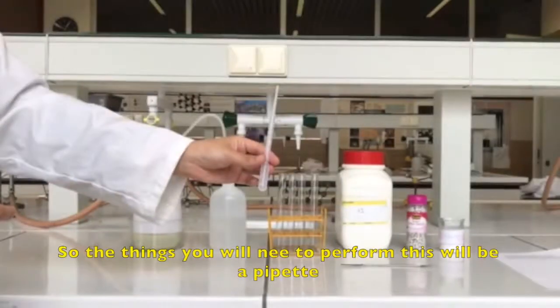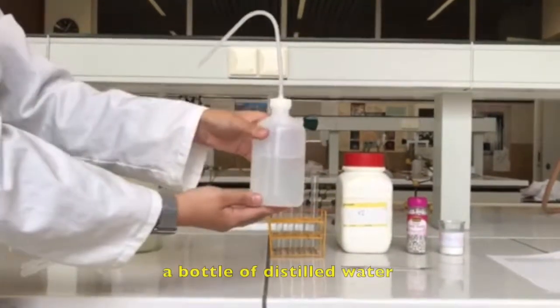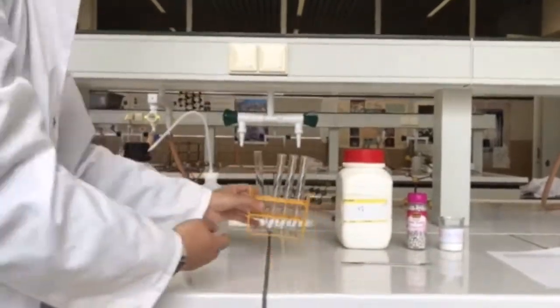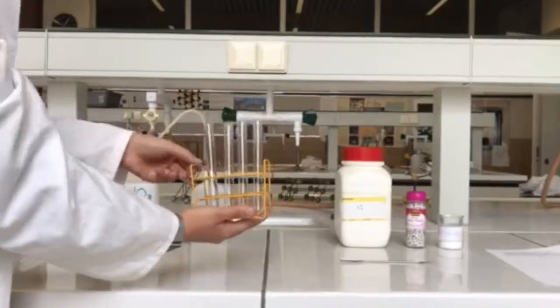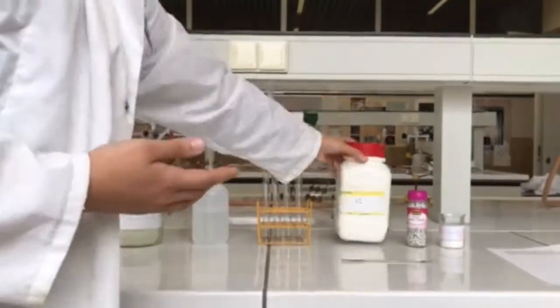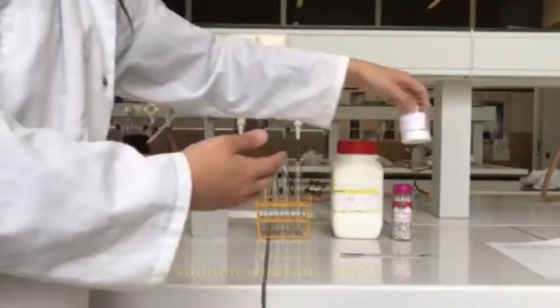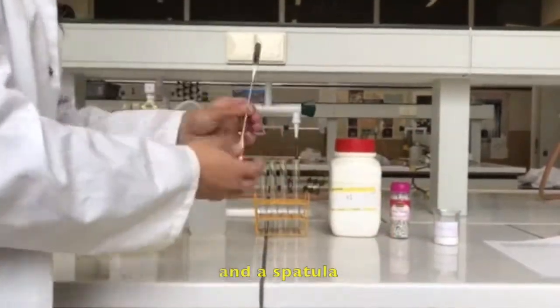So the things you will need to perform this experiment would be a pipette, hydrogen nitrate, a bottle of distilled water, a rack with four test tubes, potassium iodide, silver colored sugar pearls, sodium chloride and a spatula.